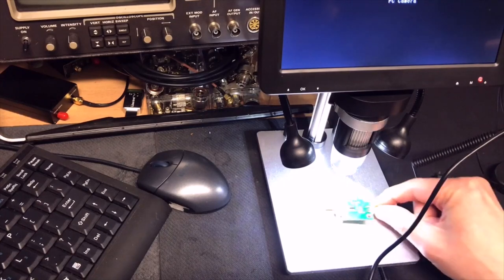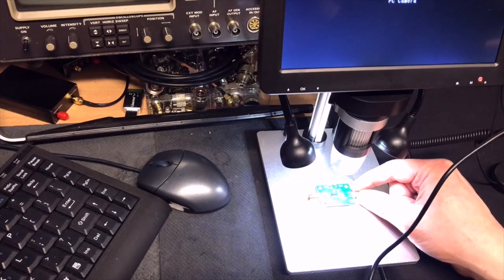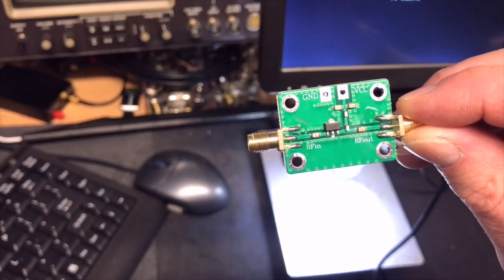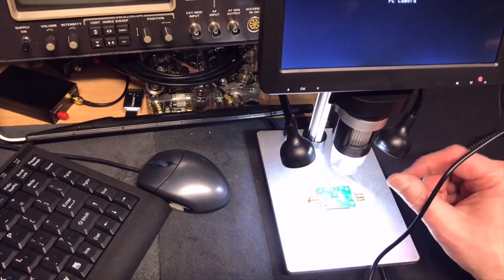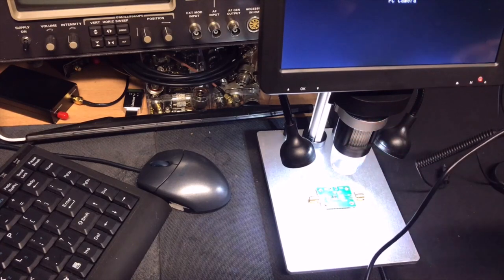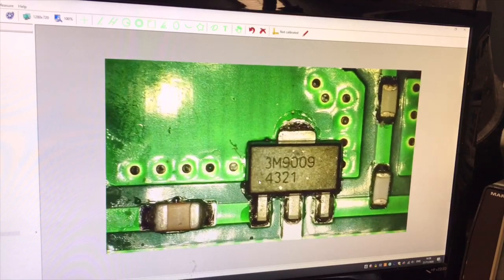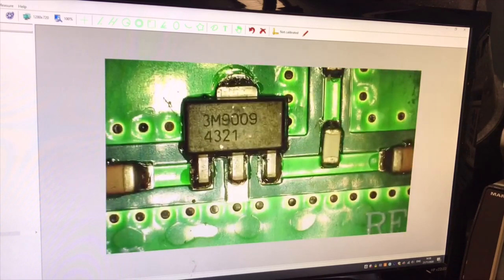Okay, I will put there a little, it's an RF amplifier receiving. I will just put it underneath. And let's go to the computer screen. Yeah, back to the computer screen. I will just focus. So, well, if you can see, this is good amplification, but the resolution is not that high, but it is enough.